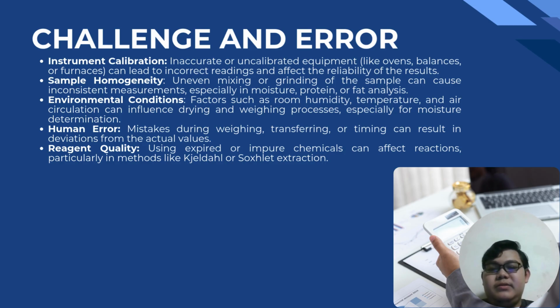Then we have human error, which is mistakes made during weighing, transferring, or timing that can result in deviation from the actual values. Last but not least, we have reagent quality, which is using expired or impure chemicals that can affect reactions, particularly in methods like Kjeldahl or Soxhlet extraction.